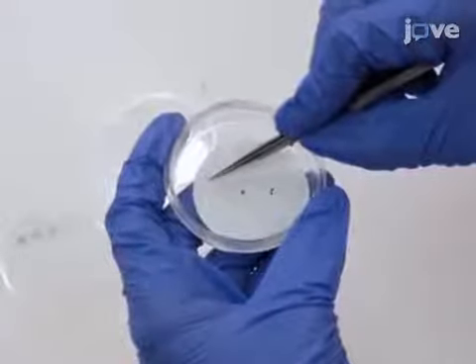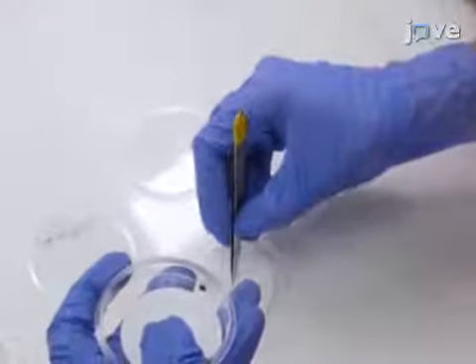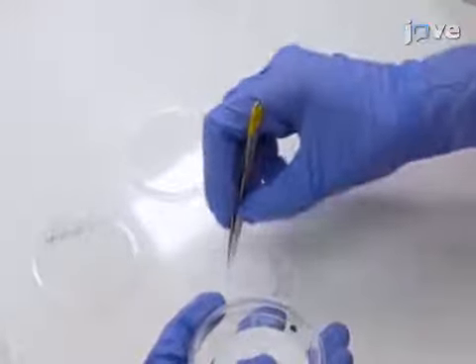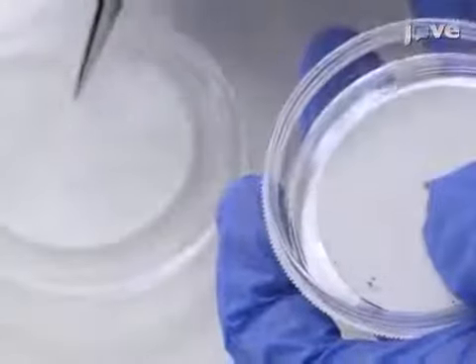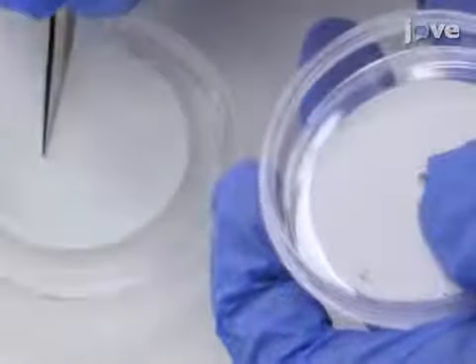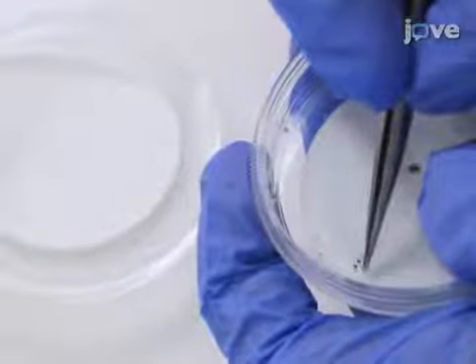Once the eggs have aged appropriately, remove the bedbug eggs gently from the filter papers using soft-tip forceps. Gently scrape the bottom of the egg attached to the filter paper using the forceps, and then gently grab the egg without applying too much pressure to avoid tossing the bedbug eggs.